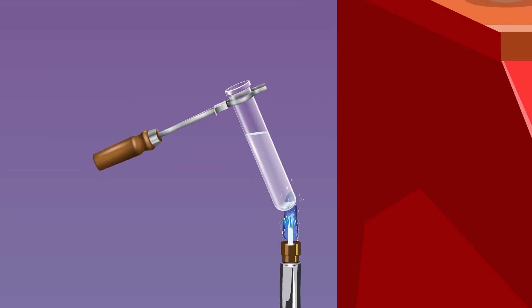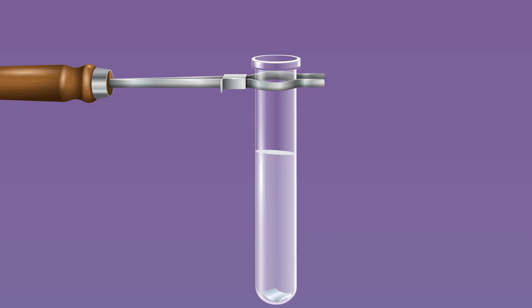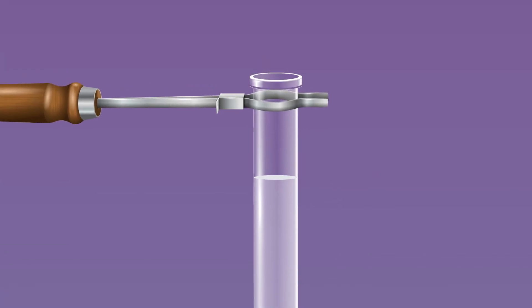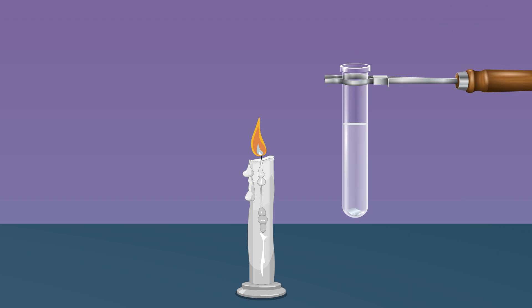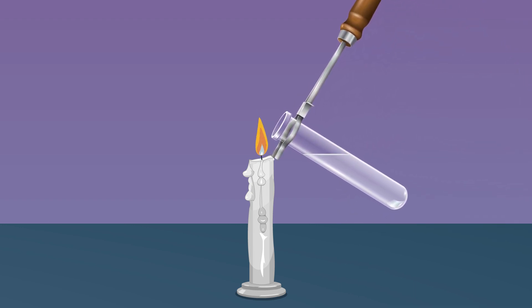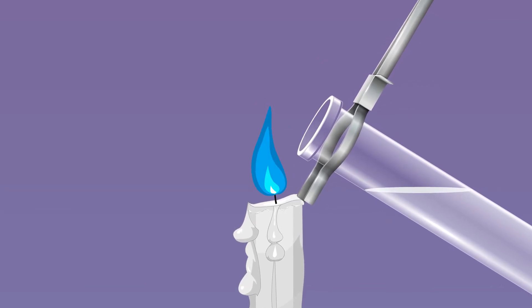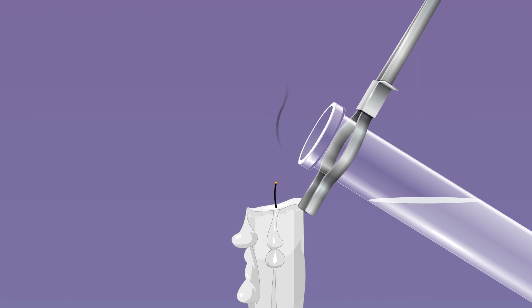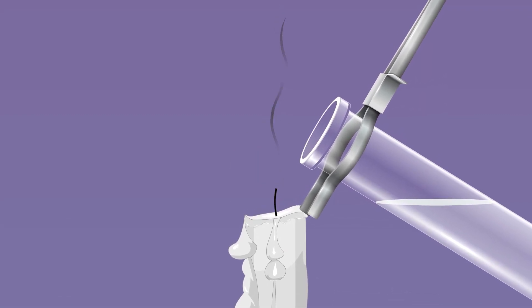Heat the test tube using a Bunsen burner and observe the effervescence and colourless gas coming out through the test tube mouth. Bring the lighted candle to the mouth of the test tube when the colourless gas is liberating — we observe that the hydrogen gas coming out causes the flame to flare up, and the mild explosion and popping sound indicate the flame dips out.